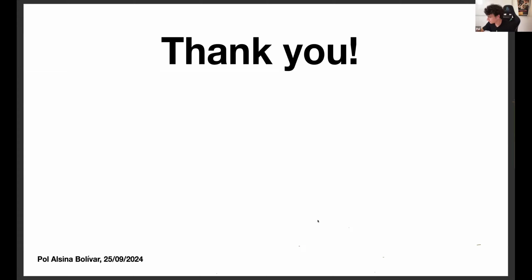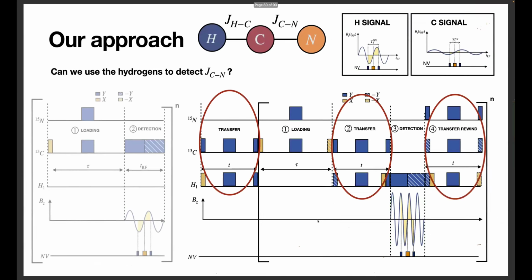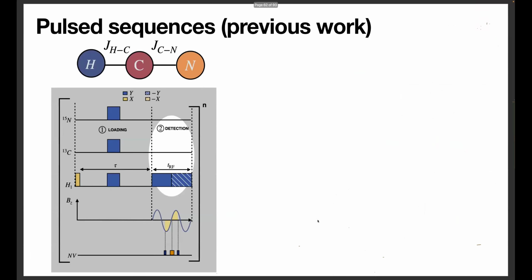The first one is general, because I don't know whether I understood correctly, but in all the protocols you show, you manipulate also the molecule that you are trying to measure. For example, you apply a pi pulse on the carbon. How is it possible to do that when you are trying to identify what molecule you have, or you are only interested in the interactions?